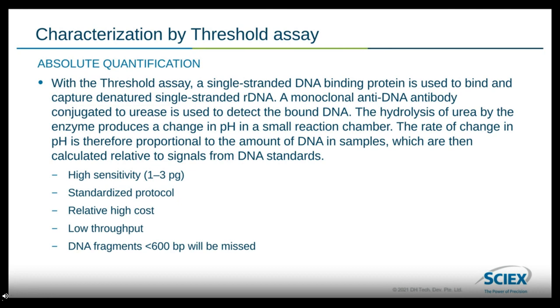This method is very sensitive, getting down to the 1 to 3 picogram range, and it has a very standardized protocol. But the throughput is low. That doesn't help us, and the cost is high.